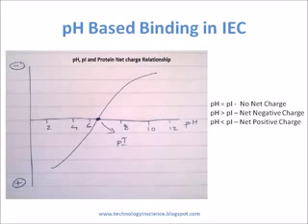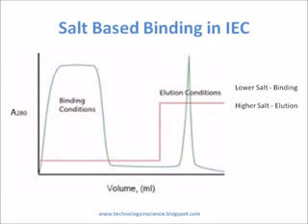Note that a cation exchange resin is anionic, having negatively charged groups, while an anion exchange resin is cationic, since it has positively charged groups. Binding to the matrix requires that buffer ions that are bound to the matrix during the equilibration process be displaced by the solutes of interest. Thus, exchange of ions takes place at the surface of the matrix. On applying the sample, conditions are chosen so that as many as possible of the unwanted solutes do not bind to the resin, leaving the molecules of interest bound to the matrix.